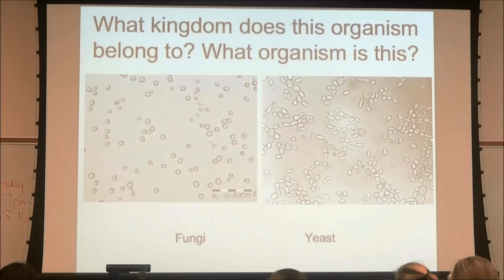Yes, they're both yeast. You just can't see it. No, you can see the cell wall more so on the left picture, and you can see the nucleus more so on the right picture. That's why I put 2 different ones up there. You guys okay if I switch?